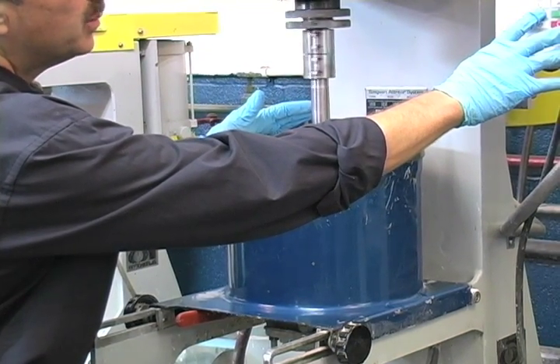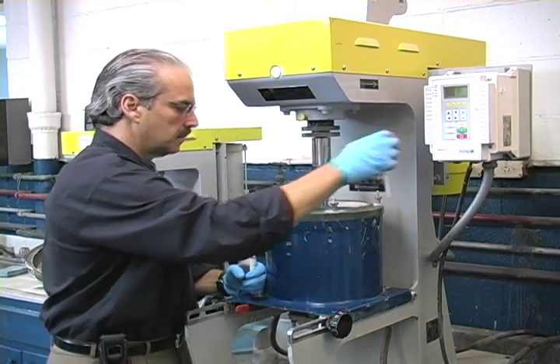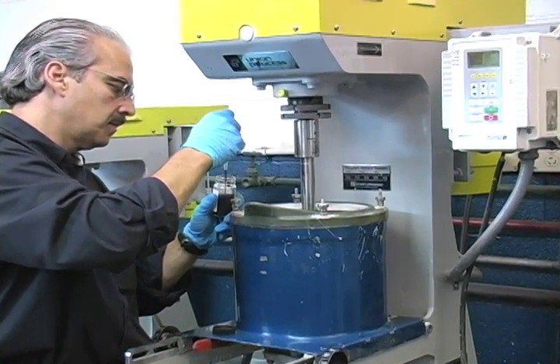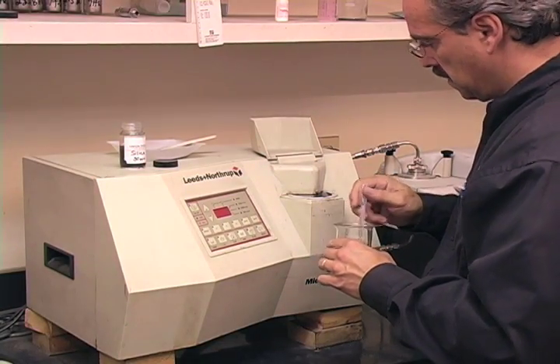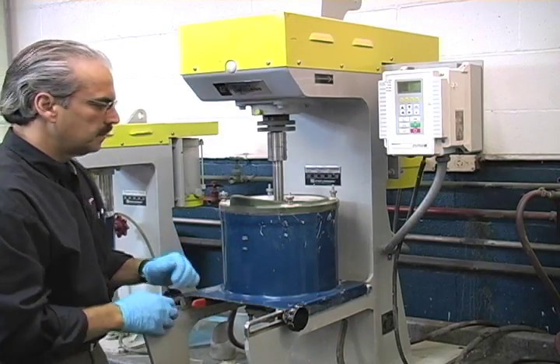The mill is then run until it is time to take a sample. To take a sample, the mill is shut off and the technician draws a small amount of material from the tank for particle size analysis. The sample is again placed into the laser diffraction analyzer to determine the particle size. If the target particle size has not been reached, the milling process continues.